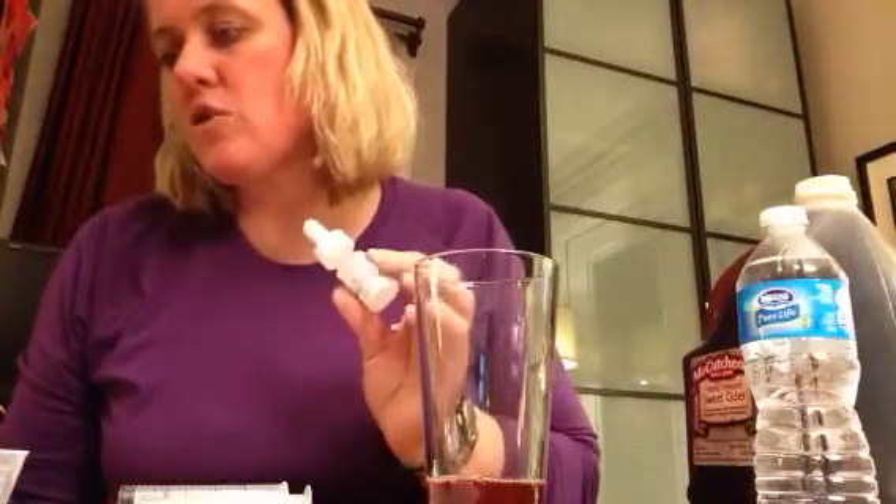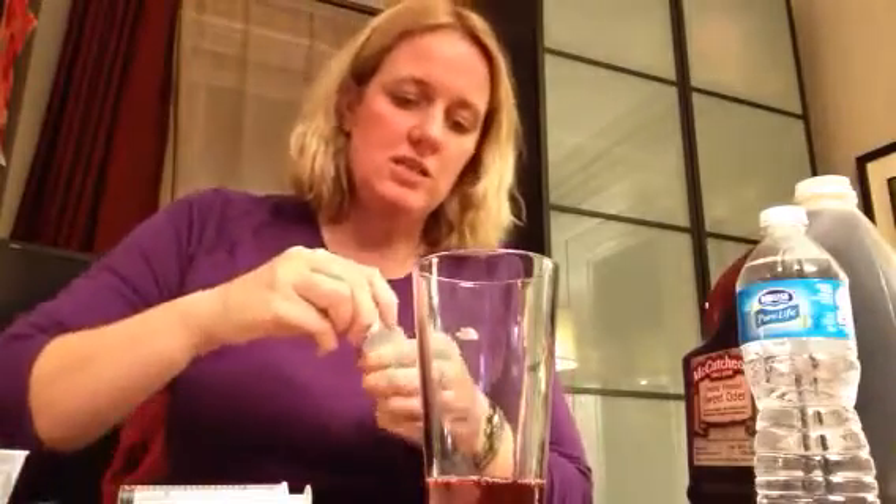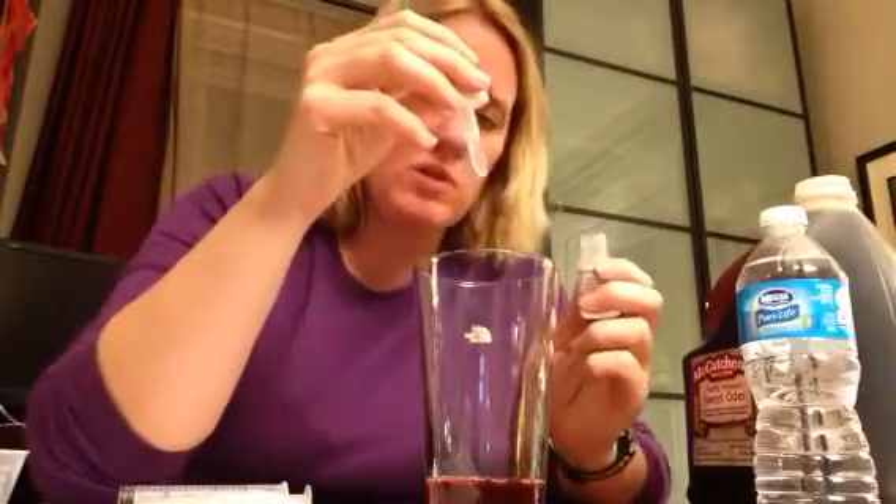The next thing is to put three drops of the color solution into the testing sample. This is what actually makes it react to the acid — it's important to measure the amount. So we're going to go one, two, three.